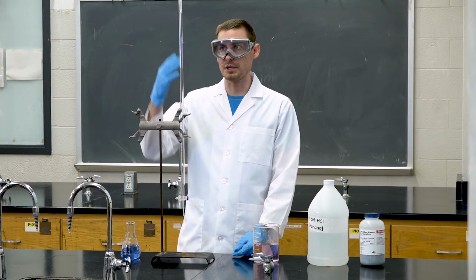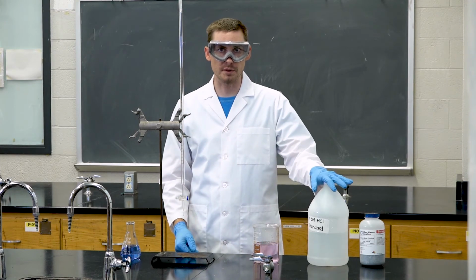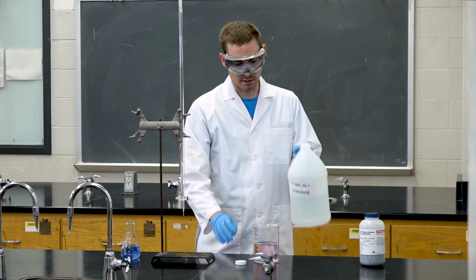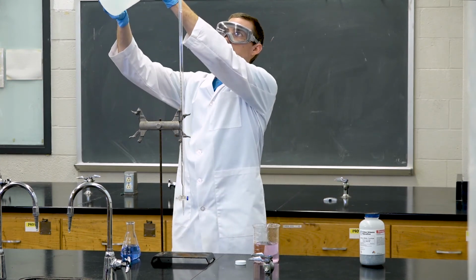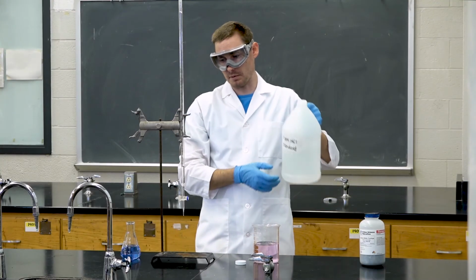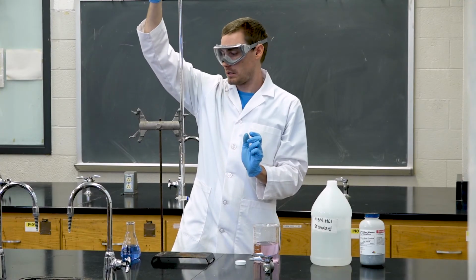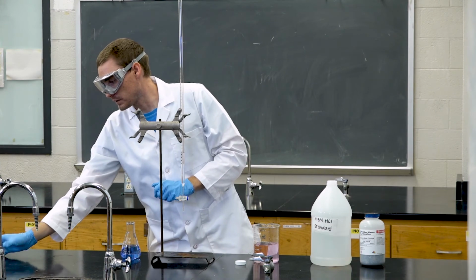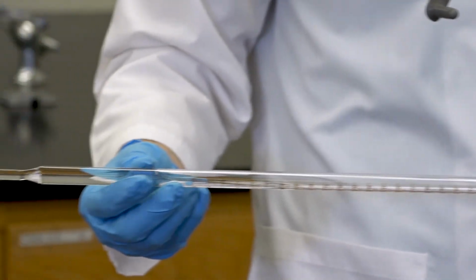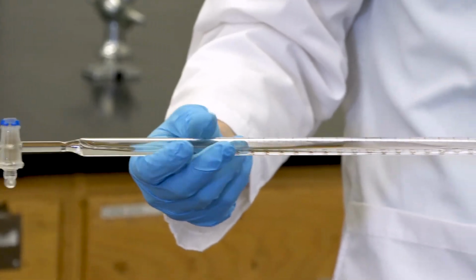Before starting the titration, we need to first rinse the burette with a small amount of the 0.3 molar standardized hydrochloric acid, like so. So just add a small amount, maybe a couple milliliters or so, until it reaches the first gradations on the burette. Remove your funnel and then allow the solution to cover all the parts inside of the burette.